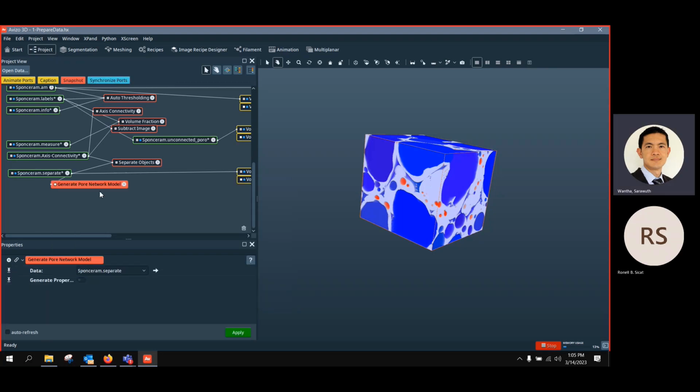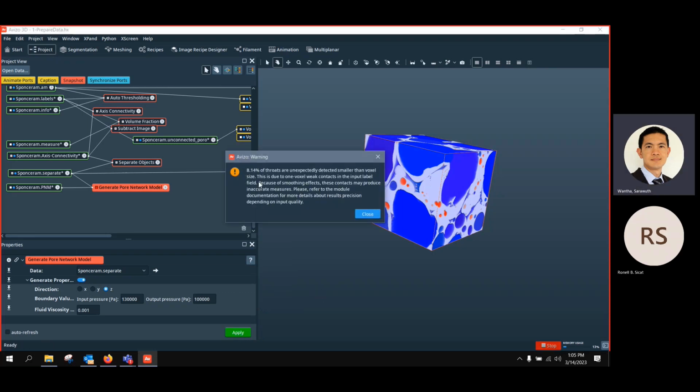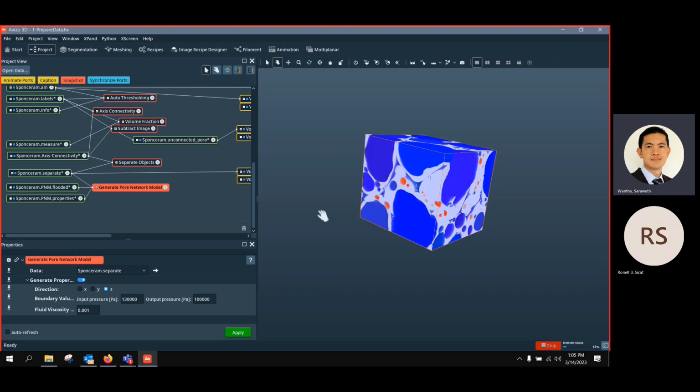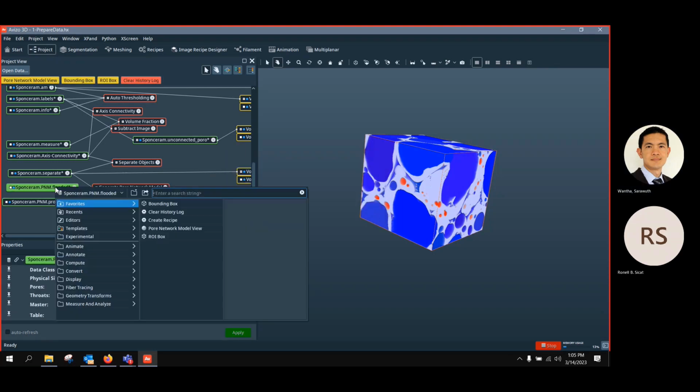And it seems to have all the error warning every time when you run it. The properties, so I will come back to you. So actually that's why it's 0.7%. It is only 8%, so that's why it's really not 70%. Yeah, it's 8%. So the same warning. So I will come back to you on this question, and the rest is just to visualize them.